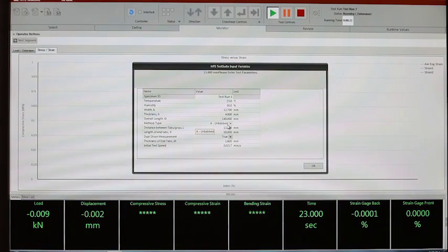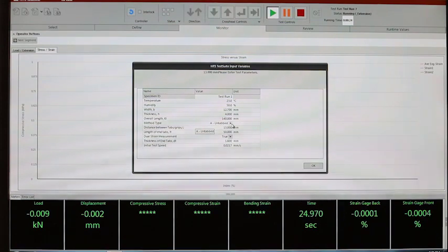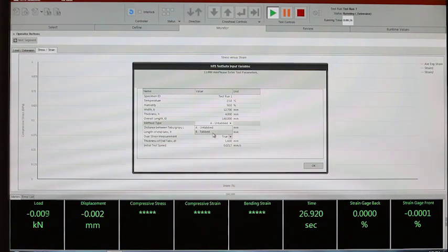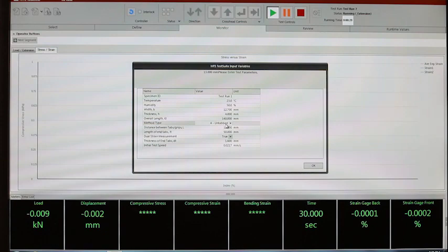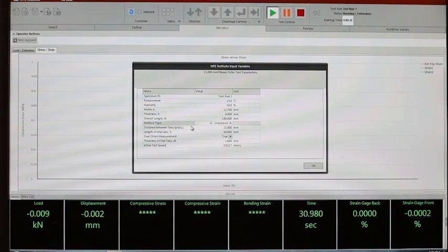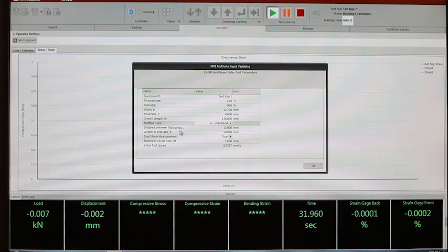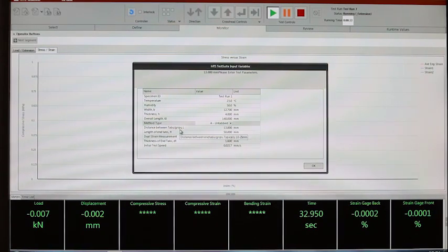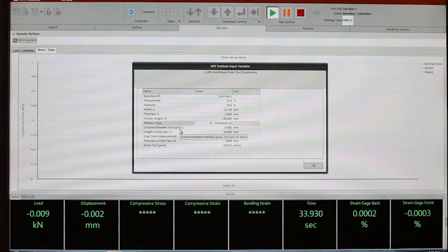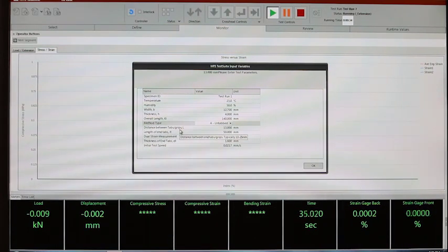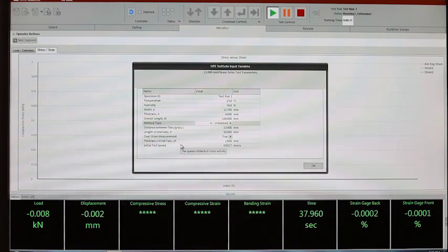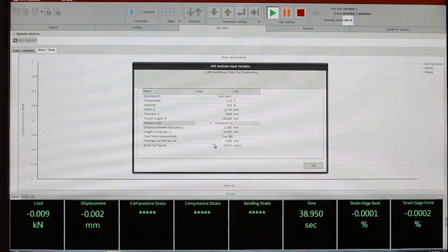The template supports two types: untabbed and tabbed specimens. We are using an untabbed specimen in our test, so information with regards to distance between tabs, length of end tabs, and thickness of tabs is not relevant.